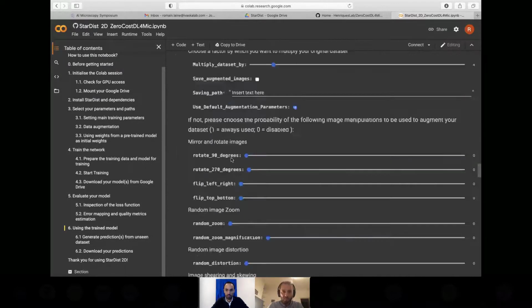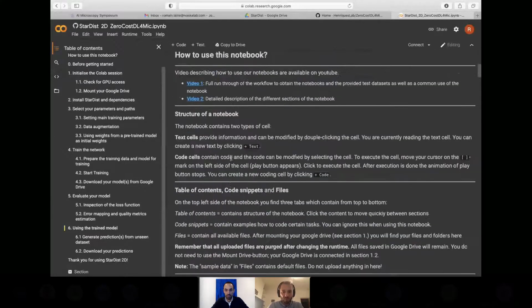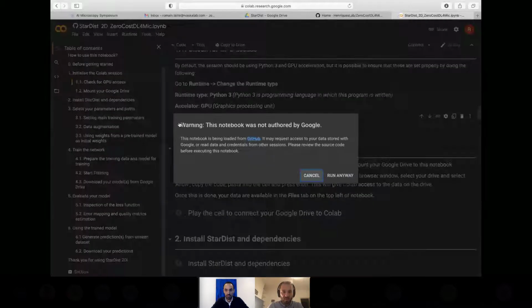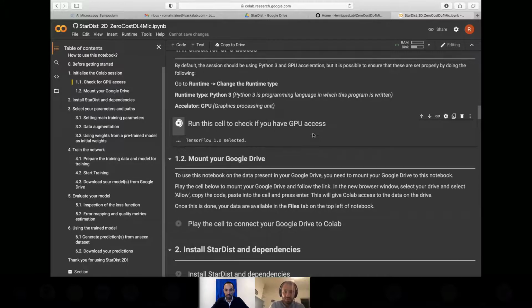And just to give you a rough idea, I've just opened this page, and so can you in a couple of seconds. If you want to start using it, it's as simple as running the notebooks online. The connection to Google Colab and the cloud platform is done absolutely immediately.